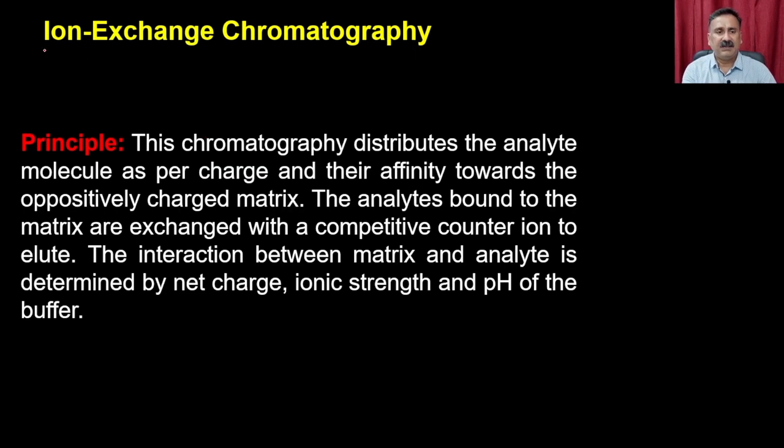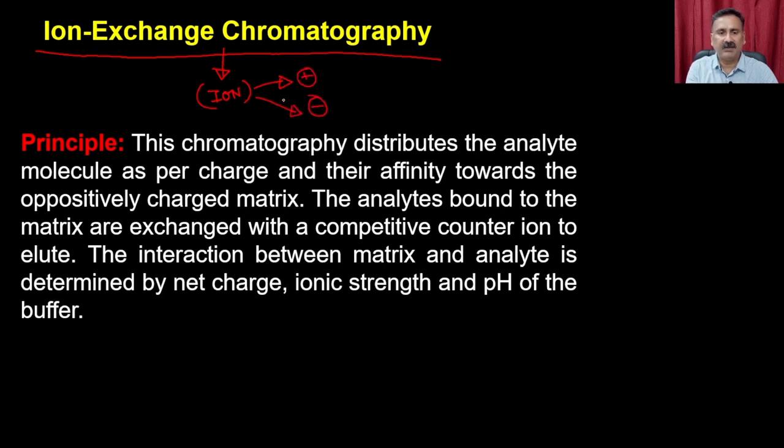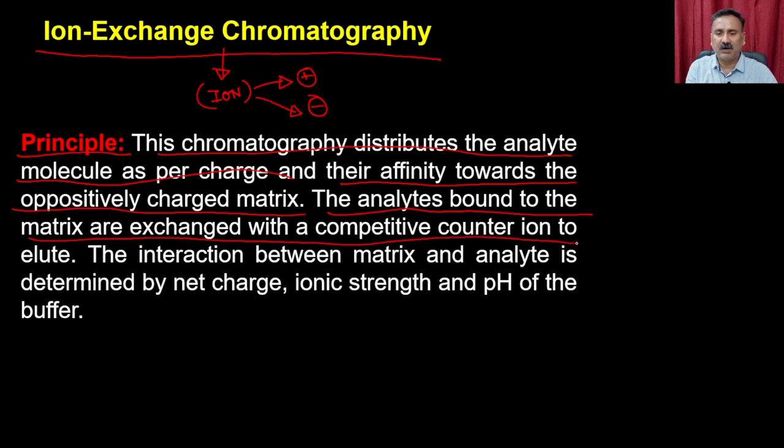As the name suggests, ion exchange chromatography is the chromatography where you are going to play with different types of ions. Ions could be positively charged or negatively charged. So what is the principle of this technique? This chromatography distributes the analyte molecules as per their charge and their affinity towards the oppositely charged matrix. The analyte bound to the matrix is exchanged with a competitive counter ion to elute. The interaction between the matrix and the analyte is determined by the net charge, ionic strength, and the pH of the buffer.